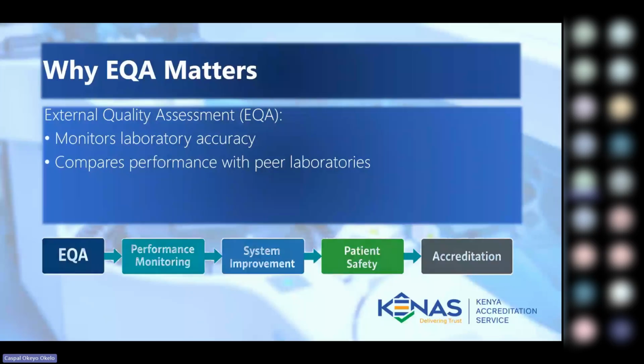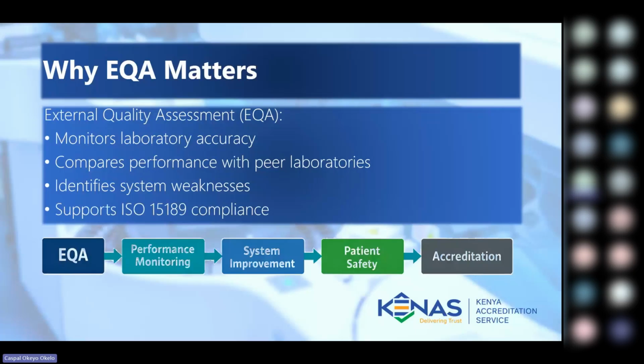And if we are ISO accredited or planning to be, our EQA will be a reflection of the strength of our entire quality system. Greatest of all is that EQA protects patients, and that's the ultimate reason, beyond being a regulatory compliance in support of ISO 15189.